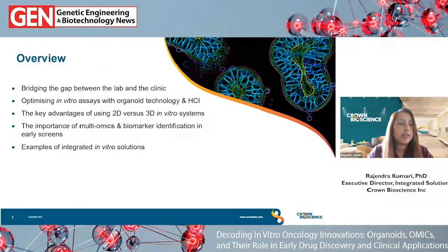Okay, so today I'll be discussing moving oncology models closer to the clinic to bridge the gap, specifically for in vitro systems, and how the use of innovations like organoid technology or high content imaging can be optimized into the in vitro assays, describing the key advantages of using either 2D or 3D in vitro systems, and when to incorporate multi-omics approaches into drug discovery programs.